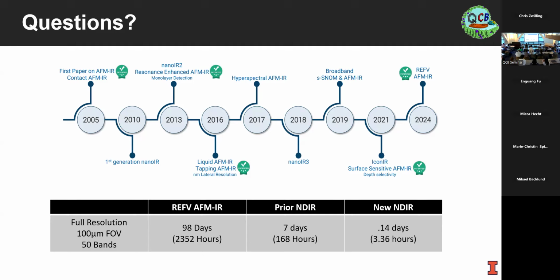Ashwin's almost made progress on doing serial sections. Okay. And there are systems that do that, you could just do serial sections and then image every section. So with the new system I'll have access to the controls to identify where regions are and then do whole hyperspectral of every section. And then we can build up a 3D image. But that's a ways out. That'd be genius. Maybe a couple months.